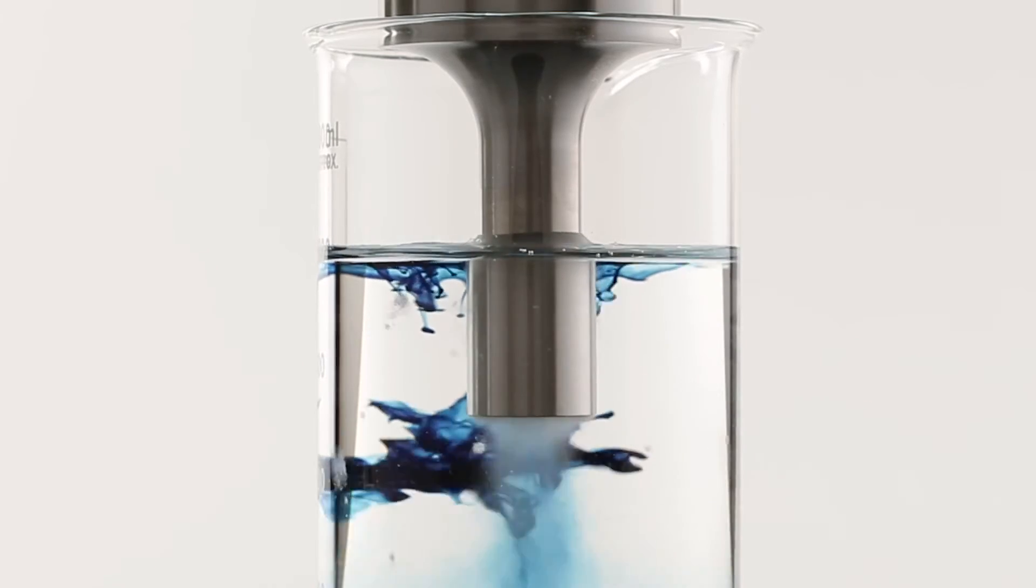True Temperature Control is another exclusive Branson feature to ensure consistent, predictable results.